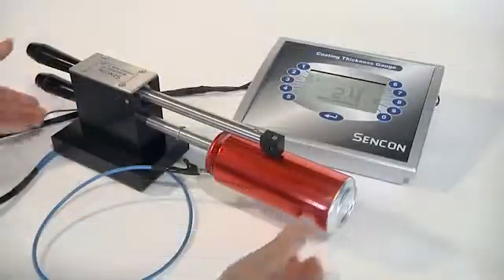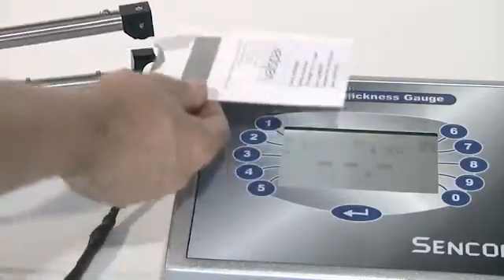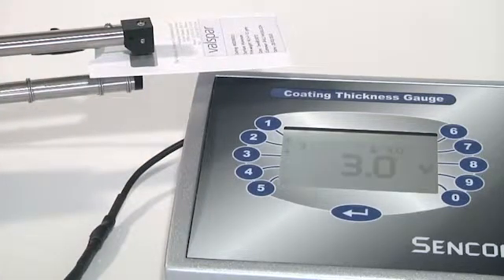The gauge compares production coatings with calibrated samples supplied by the coating supplier. It displays results immediately and accurately on screen and can transmit the data to a PC.